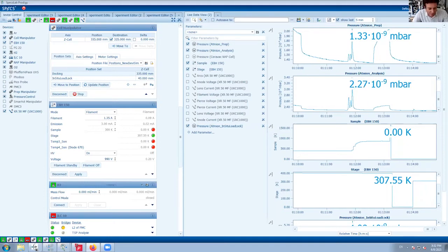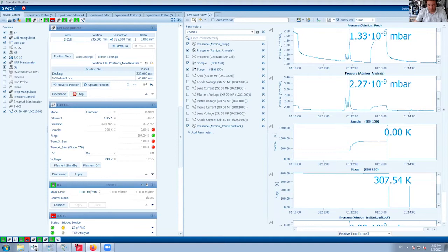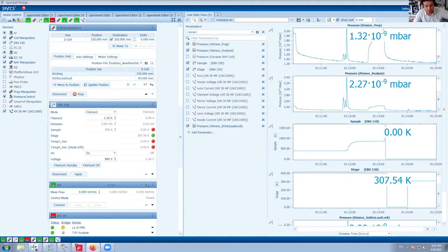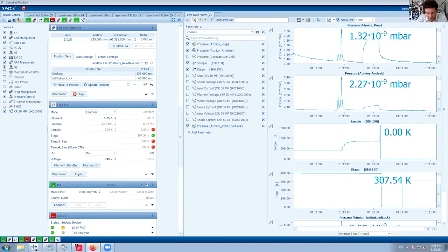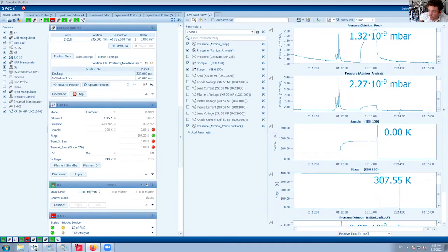There was also the other part of the question. Yes, of course, you can use a tape as well for the powder samples. However, again, it's the same as with indium foil. You cannot use it for high temperature experiments. It can be done when you want to do some measurements in a different environment, but only at room temperature. The indium melting point is about 154 degrees C. So theoretically, you can still heat up to 100, let's say.